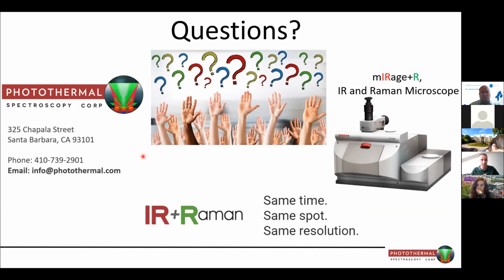If you pulse slowly, the heat will diffuse, and that will blur the spatial resolution a little bit. So we pulse this at around 100 kilohertz, which keeps the diffusion length short enough that it doesn't become a limiting factor in the spatial resolution, which means you get what the green light in theory can provide.